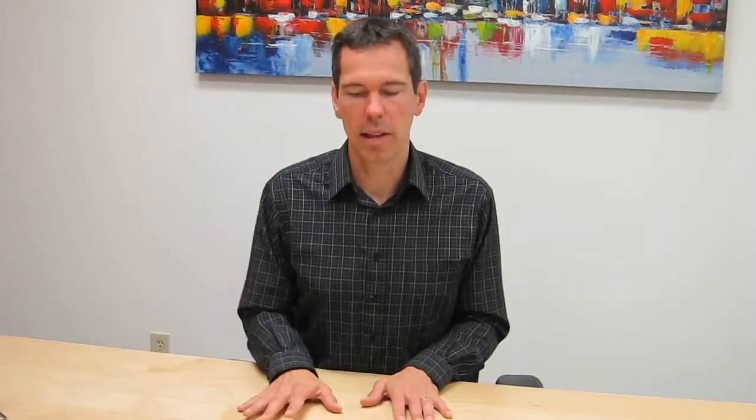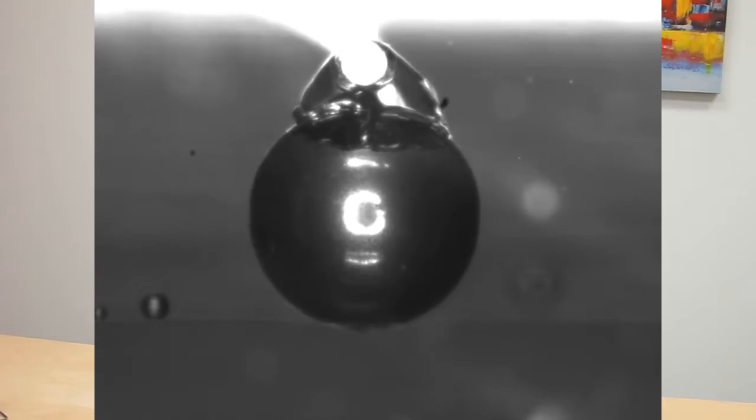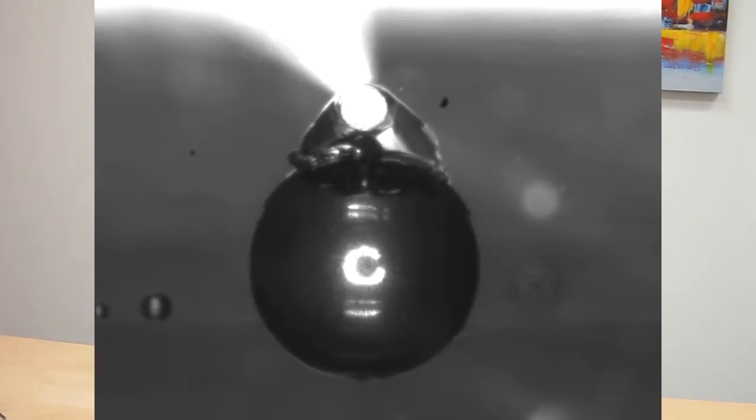The last thing I did was take that liquid agar-agar and pour it into a container and let it gel as a plane. I couldn't test the plane in parallel plate compression, so instead I did an indentation test. I took the force probe with the Micro Squisher and added a 3mm diameter stainless steel ball, and pushed that ball into the flat horizontal surface. I was able to get the force displacement of pushing that ball into the plane, and there are formulas — you can see a white paper on our website — to get the stress and strain behavior from that data.